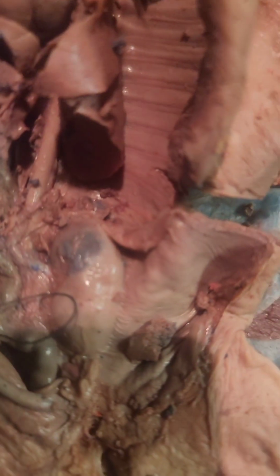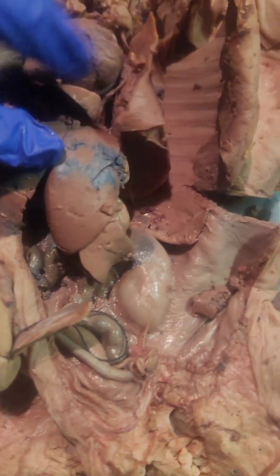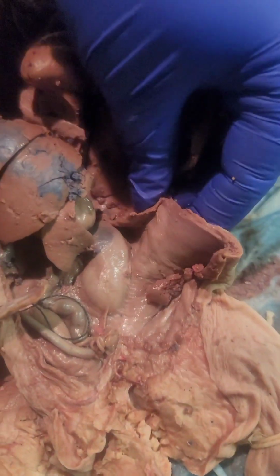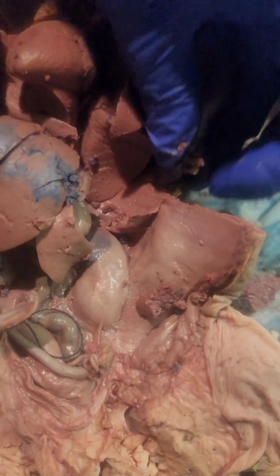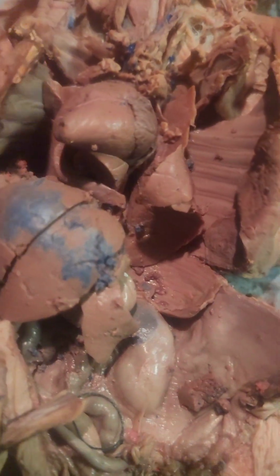Same thing on the other side. Kind of peeled it away a little bit, but it's on this side too. The abdominal wall, which would be this guy here, that it's stuck to.